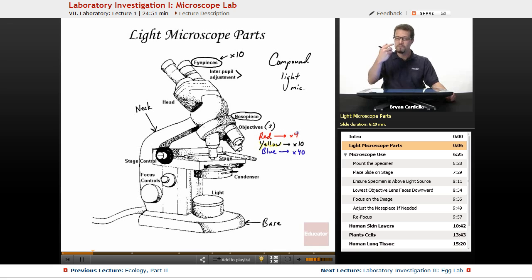So you have to actually multiply the magnifications to figure out the total. What I mean is, if you're looking through the eyepieces, which is times 10, and you happen to have the red objective lens pointing down, it would be 10 times 4. So the total magnification when you're looking through the red objective lens is times 40. If you move to the yellow one, 10 times 10 would be times 100. And then finally, times 400 with the blue. Sometimes there's even another one, which is 100, and that would be times 1,000.